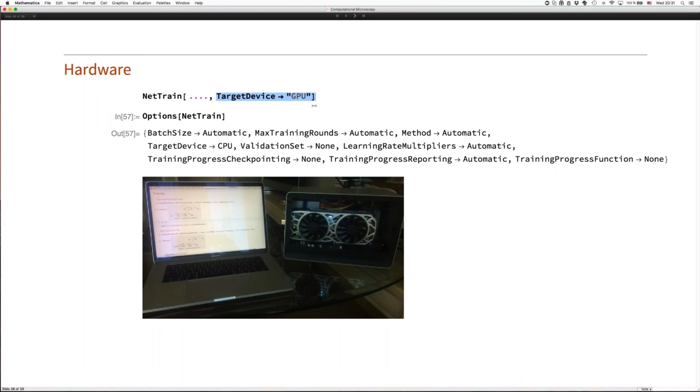Then there was a question in image processing. Quite often what you have to do is scale dependent. So you process for small objects in the image and large objects, and scale is quite a dividing line. Whatever you may pick up with a certain filter in a small scale may not work in a large scale. You would have to resize the filter. So the question is, when I train networks, are they scale specific or not?